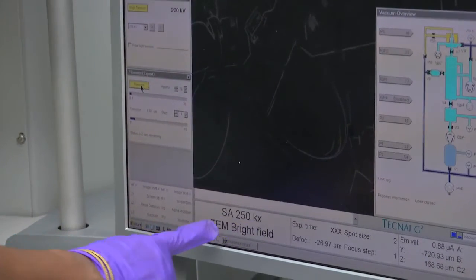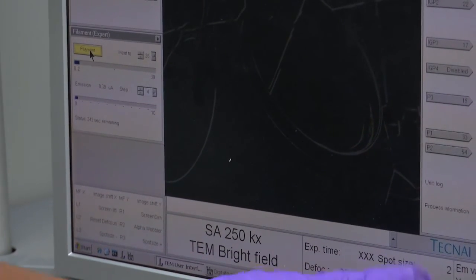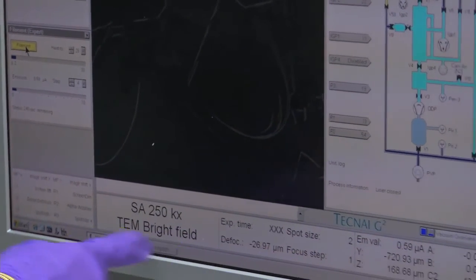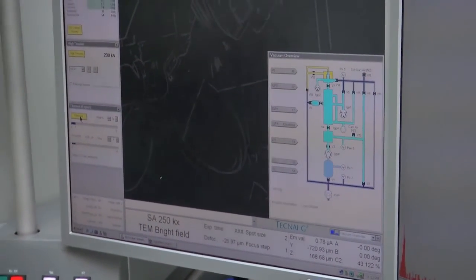Here you can see the magnification — at present I am at 250,000 magnification; spot size and other data are given here. What you are seeing is the image of a powder sample. As mentioned for the CM12, there is a copper mesh with a fine coating of carbon film of a few nanometer thickness. The powder is dispersed on the carbon film. You can see dark lines — that is the mesh image, the shadow of the mesh. Inside the squares you can see black things — that is your specimen.